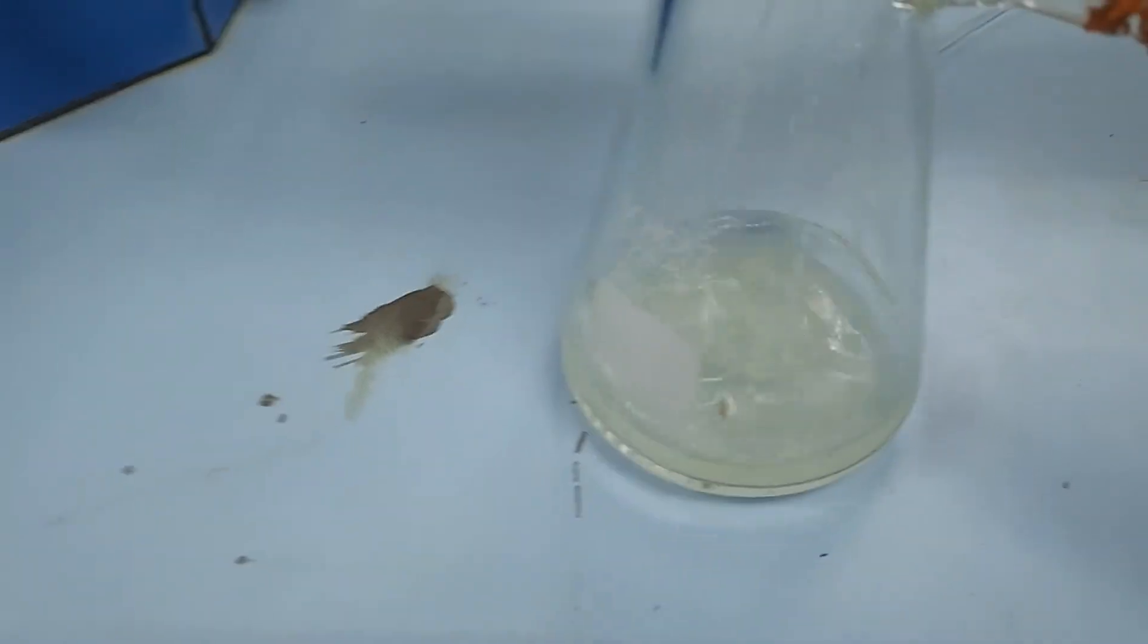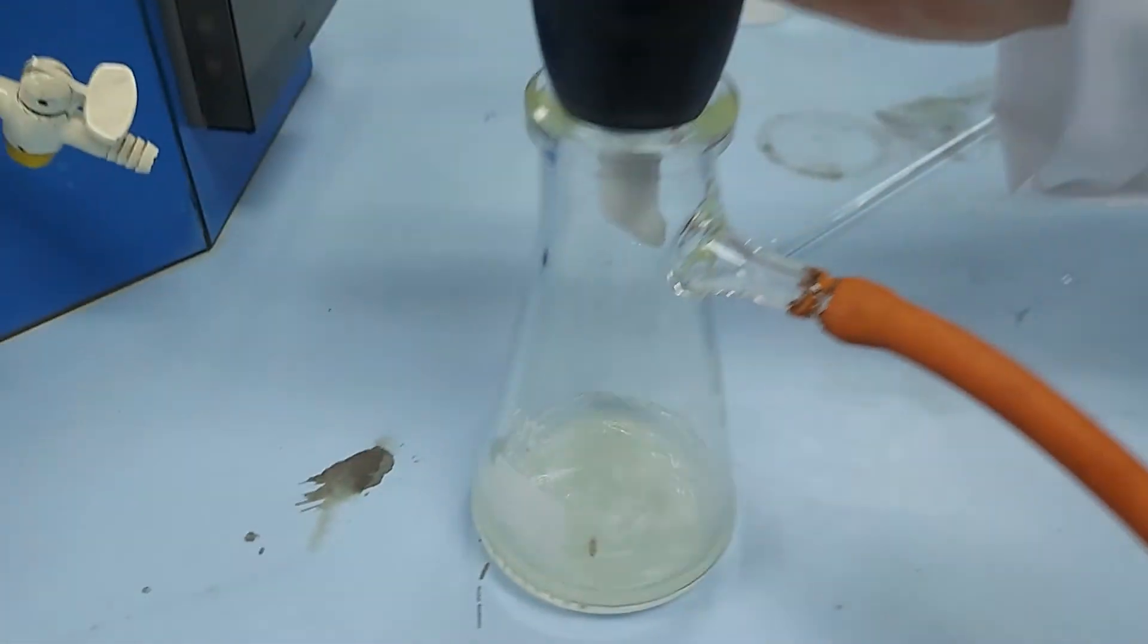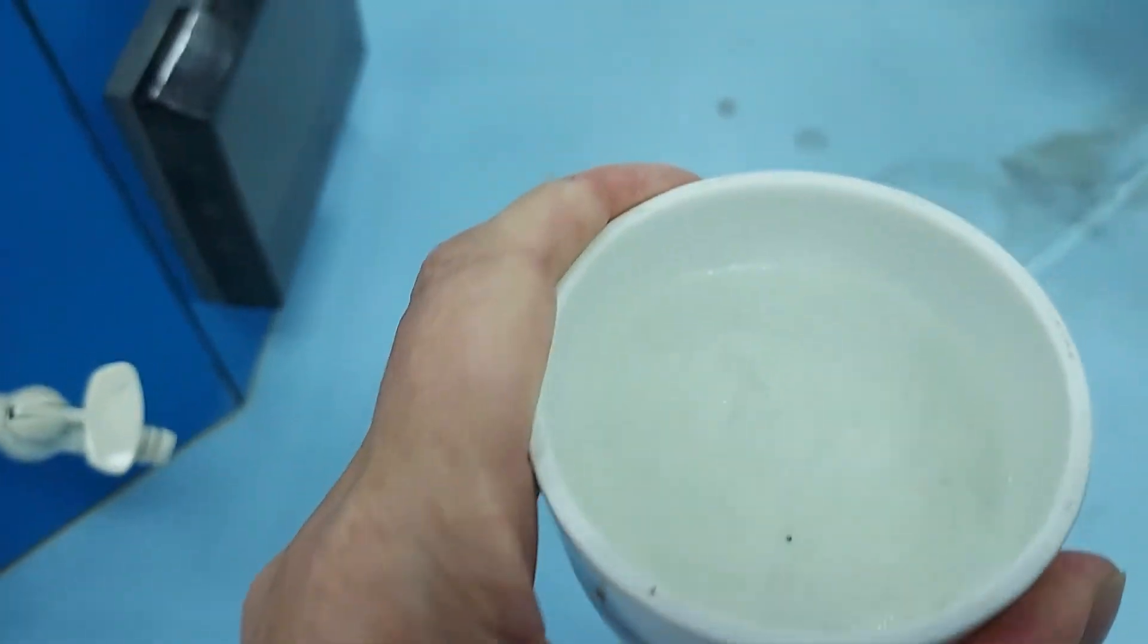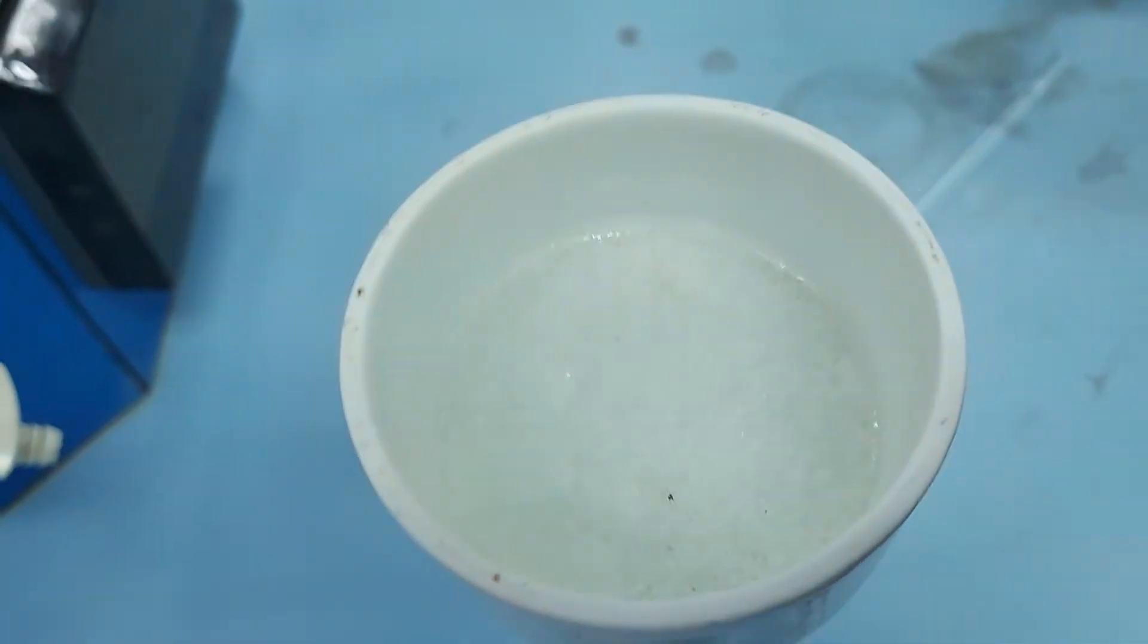So here are the impurities coming through into the Buchner funnel and we should have a pure product formed in here.